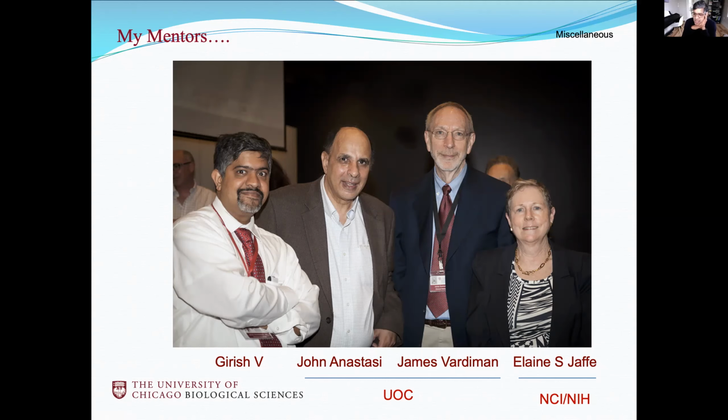With that, I'll end the session and let's see what questions you might have. One of the questions I have here from Sharav is, how is Hodgkin lymphoma reported on cytology? Okay, so this is what I tell my cytologists. They will show the slide to me and they will say, scattered large atypical cells, Hodgkin-like cells present, recommend excision biopsy. That's what I'll tell them to say and force them to do the excision regardless. So we are not supposed to give a confirmative diagnosis of Hodgkin lymphoma in a core biopsy.